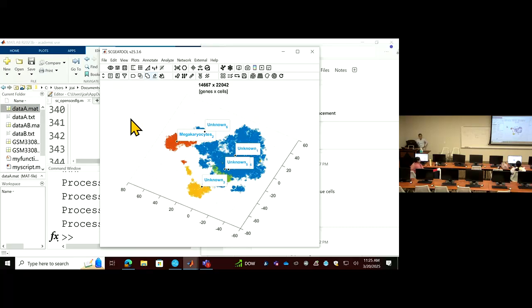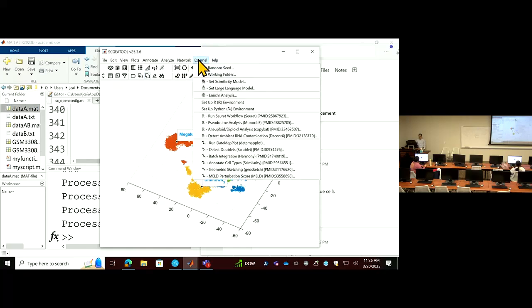All right, in the last 30 minutes, we will see whether we can successfully install Python along this. It will be very difficult because it's a hybrid of two languages, two systems. But some of the analysis, for example, in this toolbox, if you look at the external, this function with the snake, which is Python, requires the Python environment to be set up.